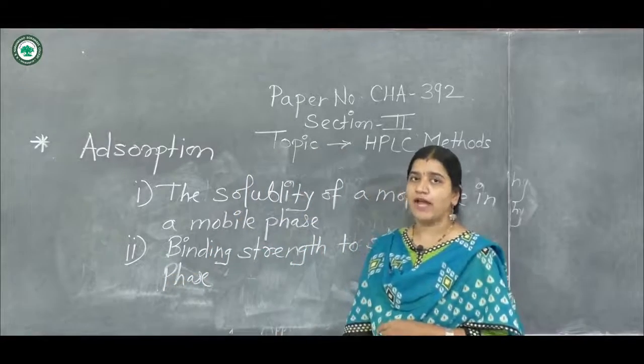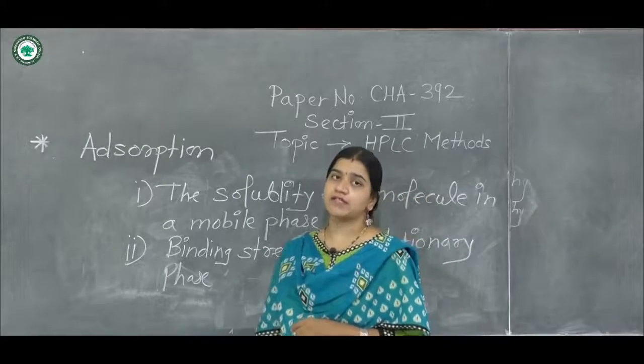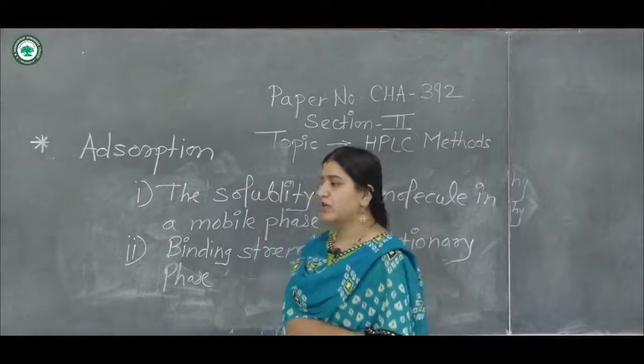So these are the two factors which determine the separation of the molecule.